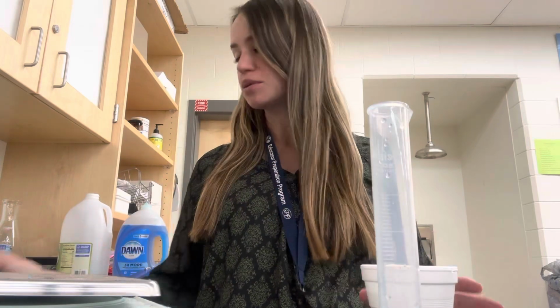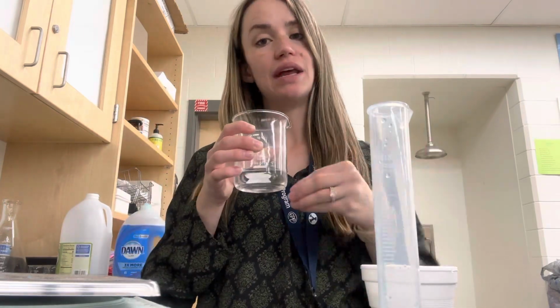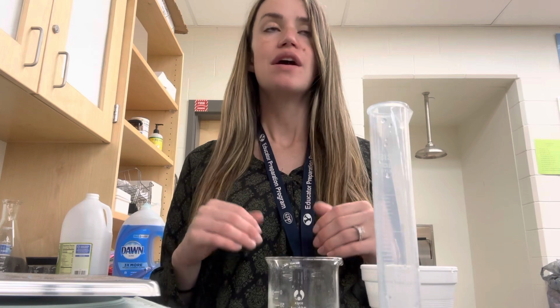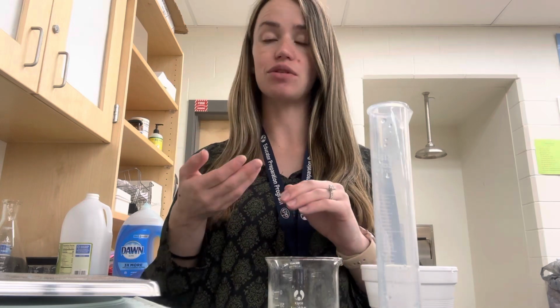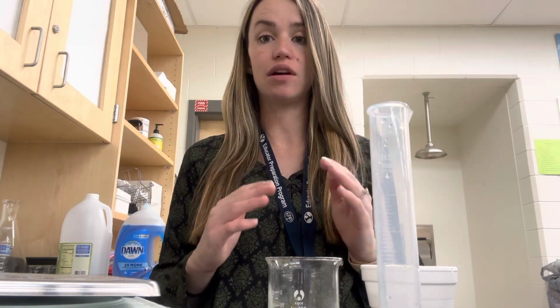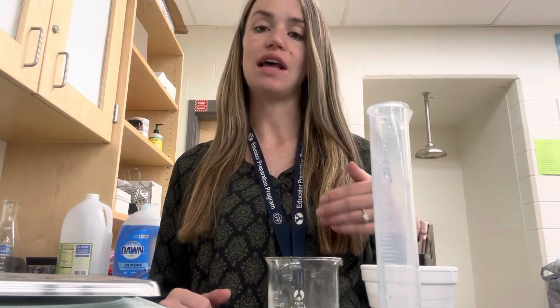What we're doing in the lab is we're taking water and we're putting a chemical in it, and we're going to mix it together and see if it's an exothermic or endothermic reaction based on the temperature of your water. So for example, if I put a chemical in and I measure the temperature of my water and it goes up, that means I'm having an exothermic reaction because I'm releasing energy in the form of heat by heating up the water in my reaction. If I put the chemical in and it goes down, that means it's endothermic because it's absorbing energy from the water, making it colder, causing that reaction.